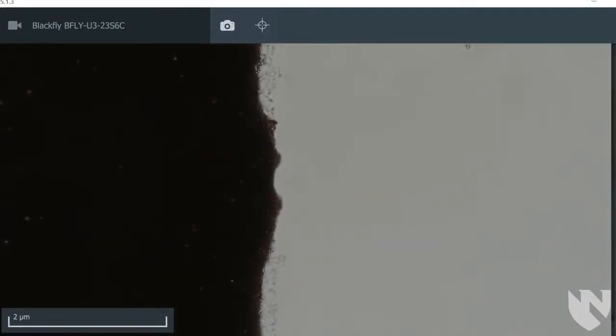If you are using a glass slide, find the place on the slide where the frosted edge meets regular glass and get that into focus, then see if you can find a squamous epithelial cell.